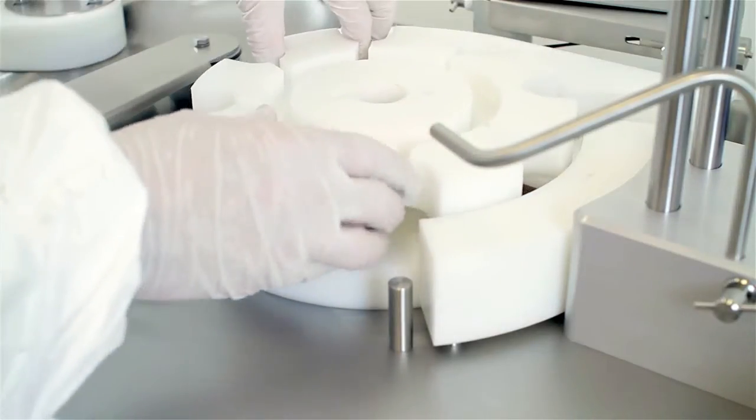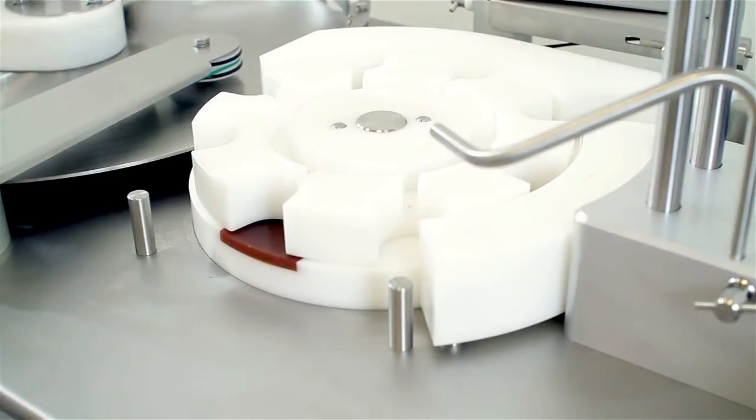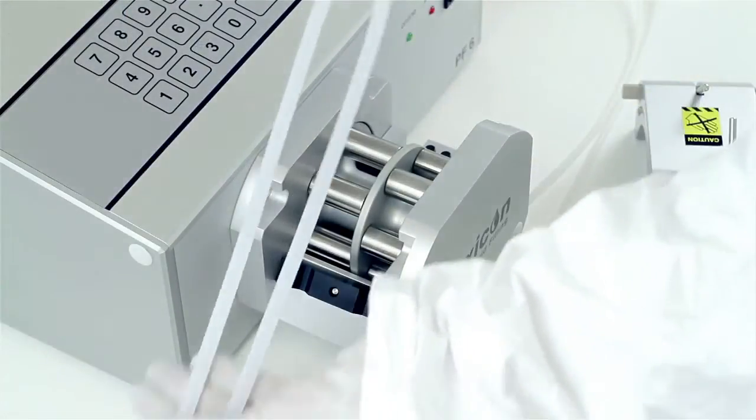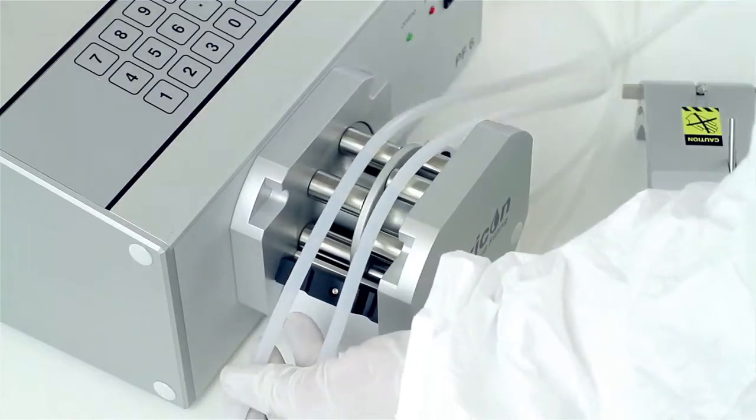A complete bottle and cap changeover can be completed in less than five minutes. The entire fluid part has been designed for single-use, preventing cross-contamination.